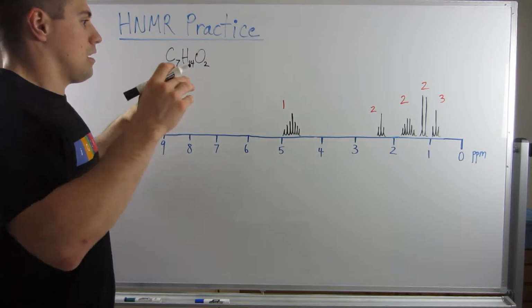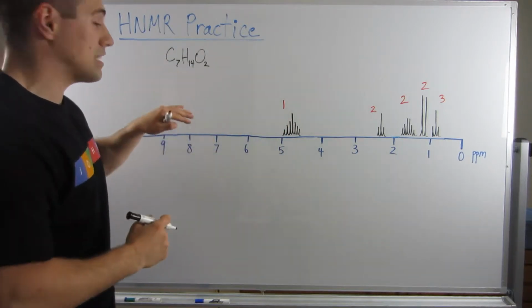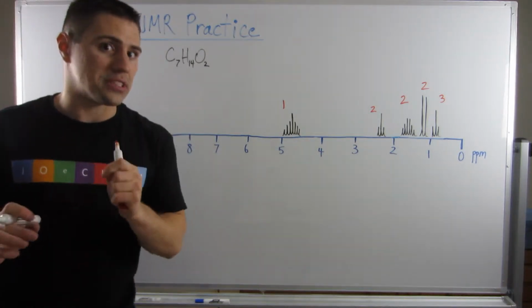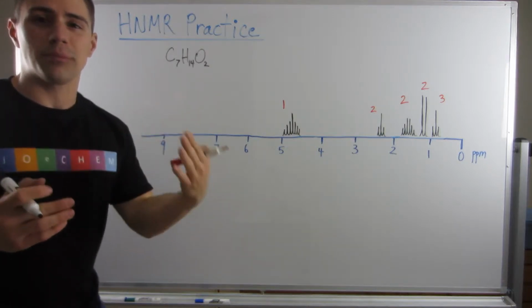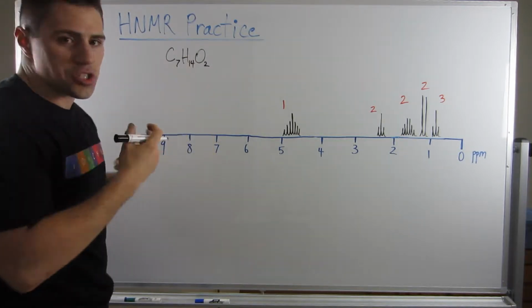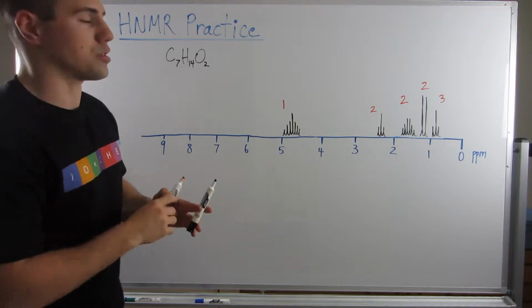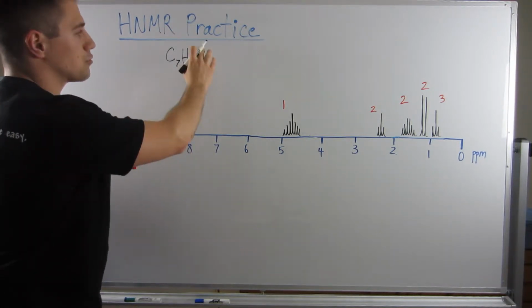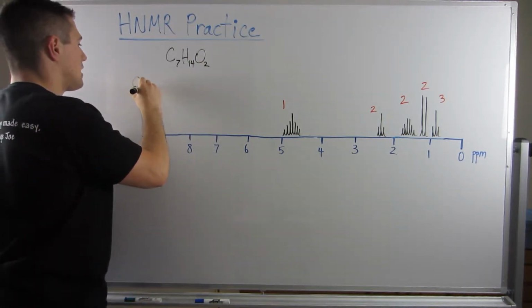Alright, so this spectrum looks a little busy, and we have our formula, so let's get cracking. So remember, very first thing we do is degrees of unsaturation. Now, I've been doing the formula, but remember in the simple case where we either have halogens or oxygens, this is the way I would do it. I don't really use the formula all that much, unless I have nitrogens involved, because they get a little interesting. So what I would do here is I would look at this formula. Remember, for oxygens, we just ignore them. I would look at C7H14.